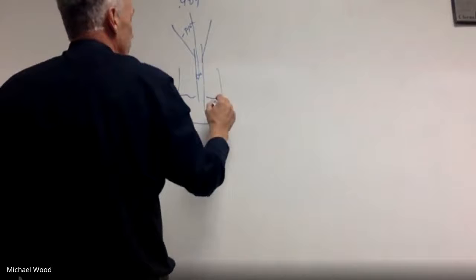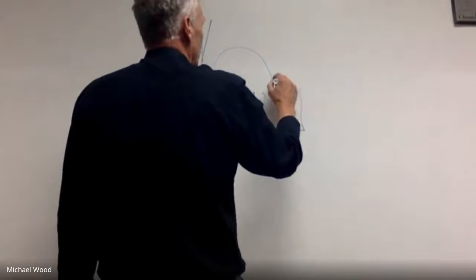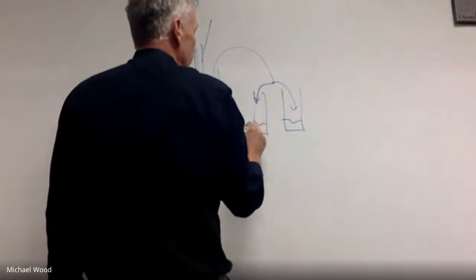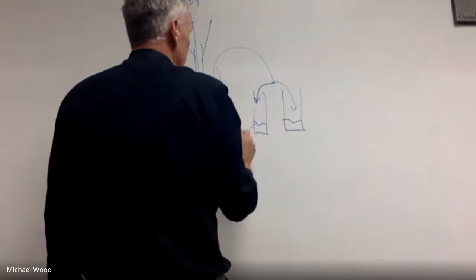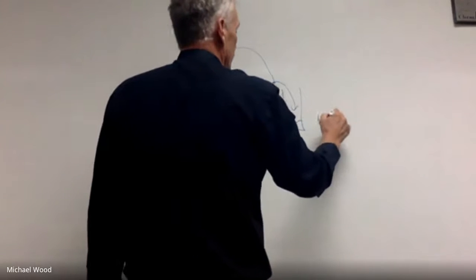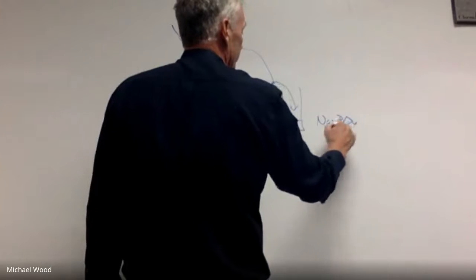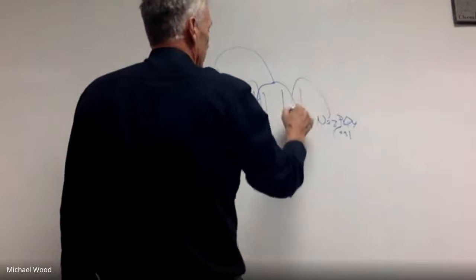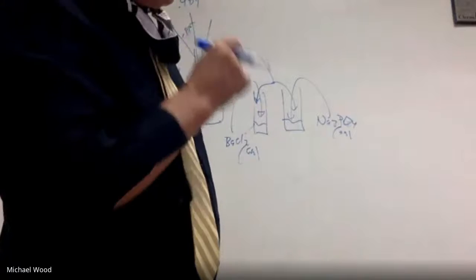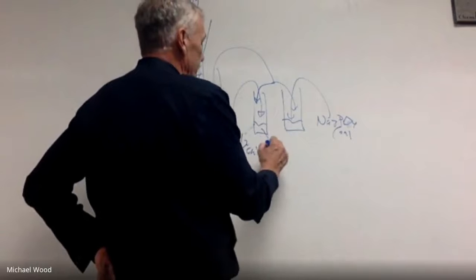0.48 grams. But then we're going to take the supernatant and split it into 2 different test tubes. So we'll have a little bit in here. In this test tube, we're going to put in BaCl2. And in this test tube, we're going to put in sodium phosphate, and these are solutions. The solution in the beaker that has the BaCl2 forms a precipitate. So over here now, a PPT forms.